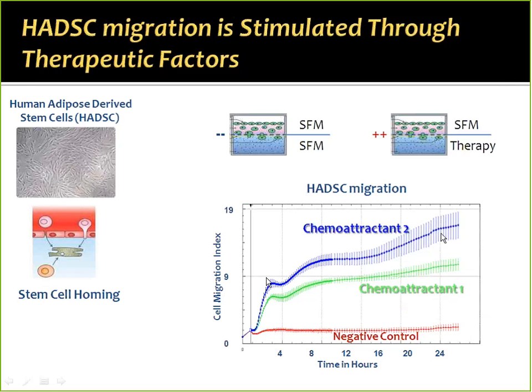There is a greater migratory response, although not as strong and pronounced as with endothelial cells and keratinocytes. But one of the things we really appreciate about using the xCELLigence, that we would have had a difficult time telling with a Boyden chamber assay, which is an endpoint assay, or with the scratch assay, is that there are differences in the profiles and the kinetics by which these different cell types are attracted to migrate.